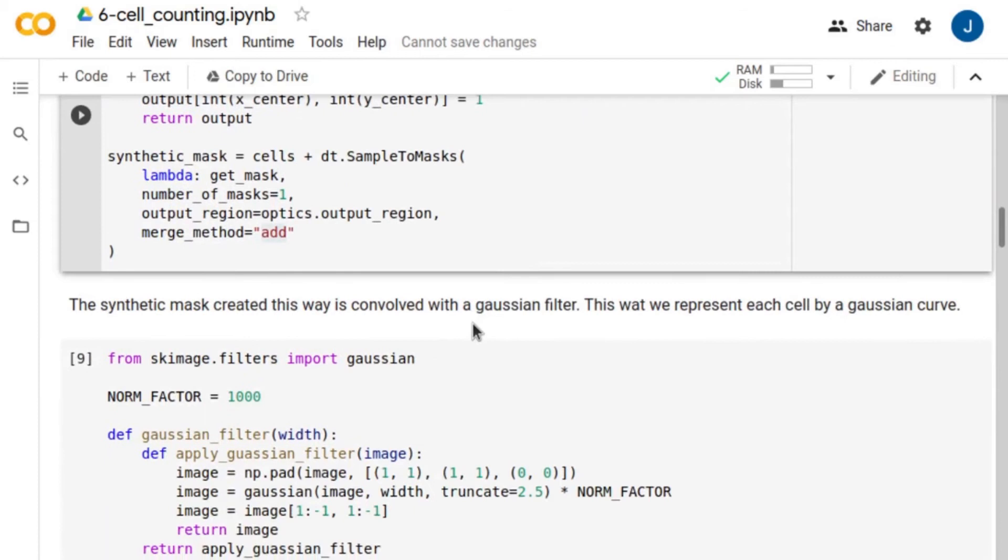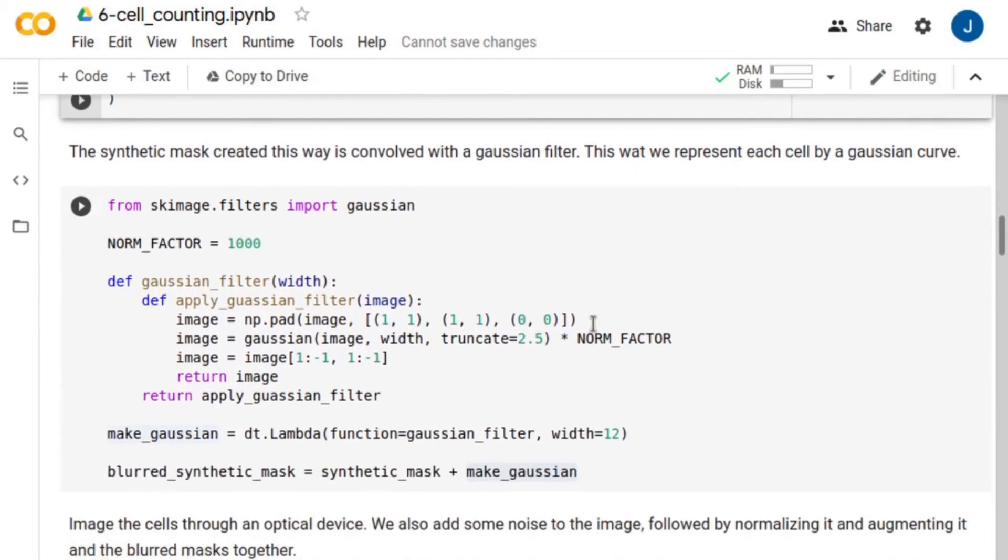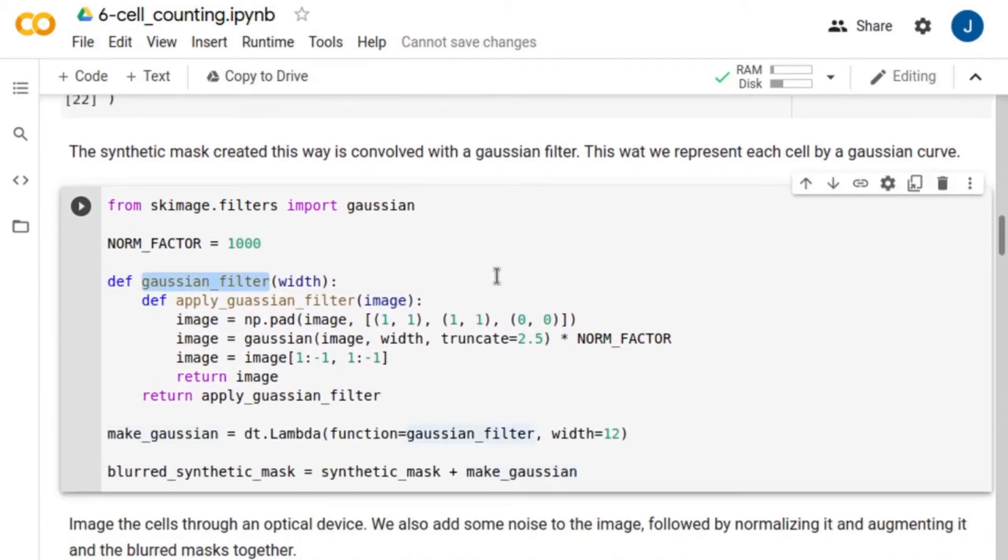Then, we convolve the generated mask with a Gaussian filter. This way, we represent each cell by a Gaussian curve.